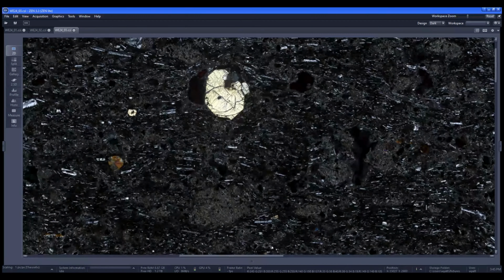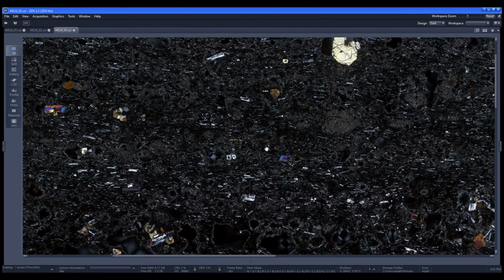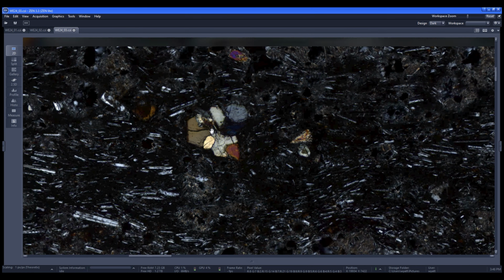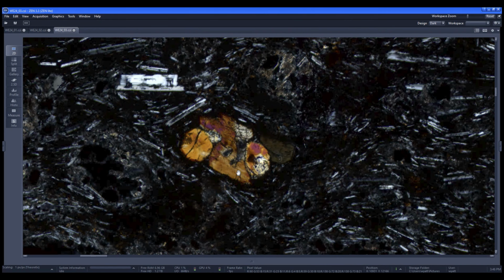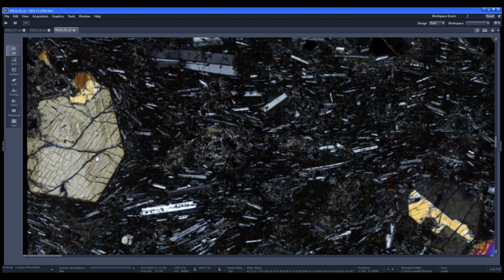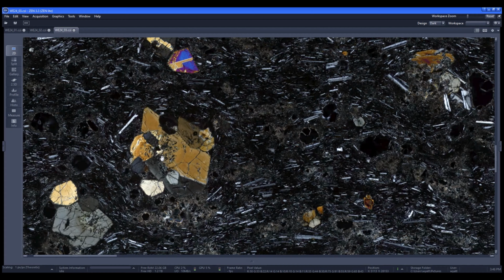There's also giant phenocryst. We have a really nice pyroxene right here. Again, you can see all the cleavage in it. Really nice euhedral pyroxene. We also have some glomerocryst in here. Here's a glomerocryst, so again, likely a chunk of the magma chamber that got pulled into this eruption and incorporated in the bomb. There's a lot more. There's another glomerocryst. You can see it's a couple minerals together. There's another really nice phenocryst of pyroxene here. There's some of plagioclase, another really nice pyroxene. Some really big ones as well.